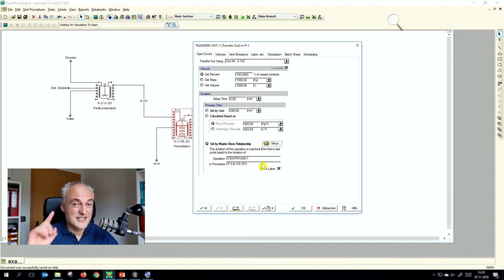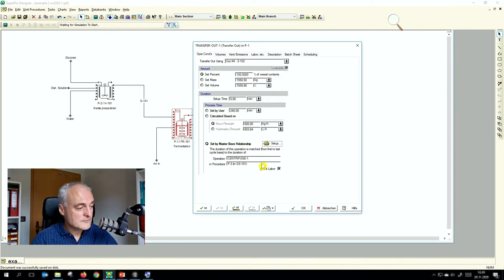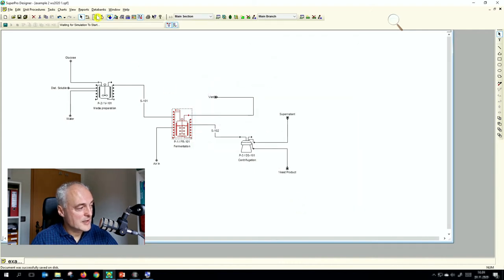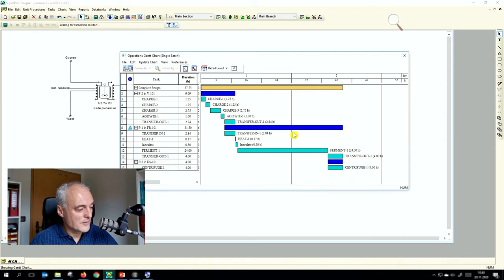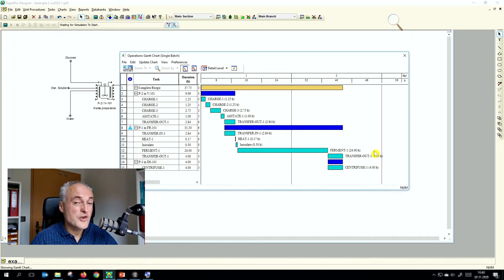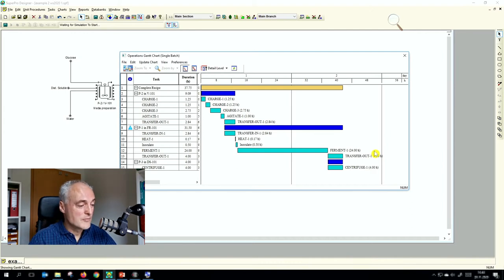After scheduling appropriately, the mass balance works. In the Gantt chart, the centrifuge operation is now scheduled according to the transfer out operation, and the timing matches exactly — four hours for both the centrifuge and the transfer out. There is no buffer; material is pumped directly through the centrifuge in a continuous process.